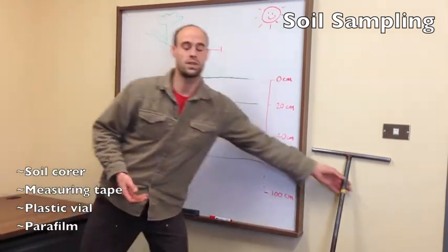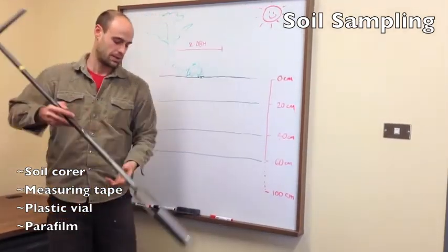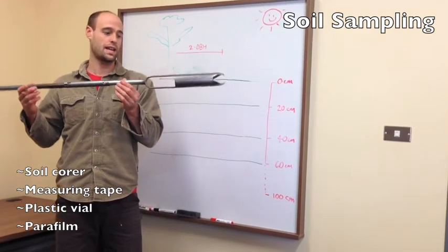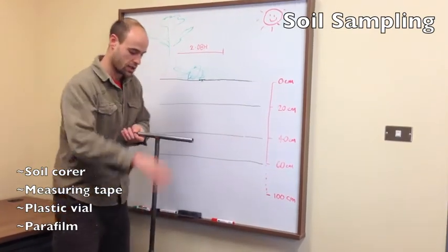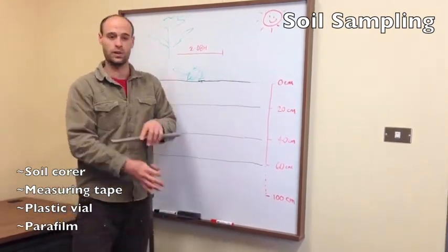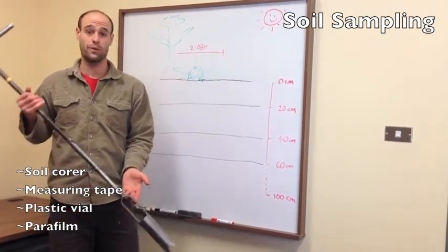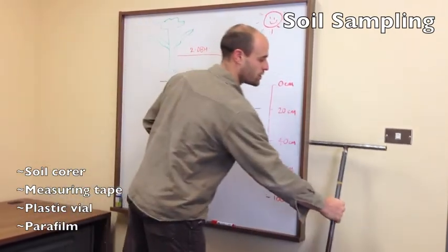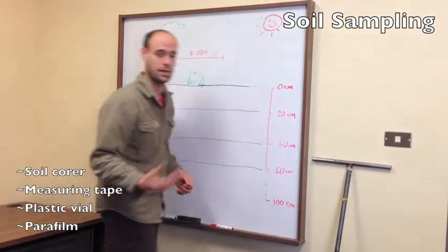To get below that, we use a soil corer, something similar to this, and we just hand auger this down into the soil. And it's very helpful to label 20 centimeters along the edge of this with tape or whatever works, marker, to know when 20 centimeters is.